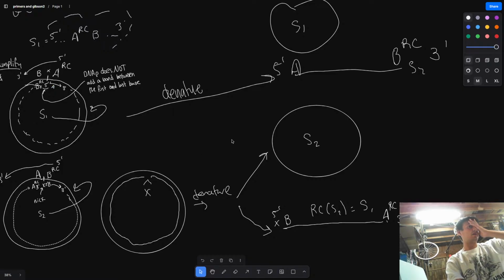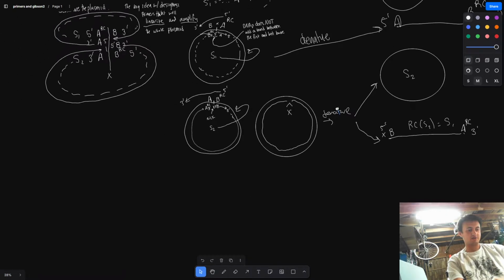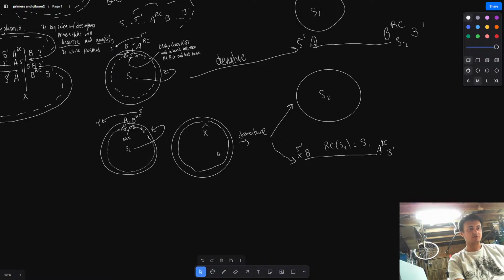Okay, now let's collect what our products are. These products are going to be two single-stranded things. So we've just denatured, and we're going to have two single-stranded things.